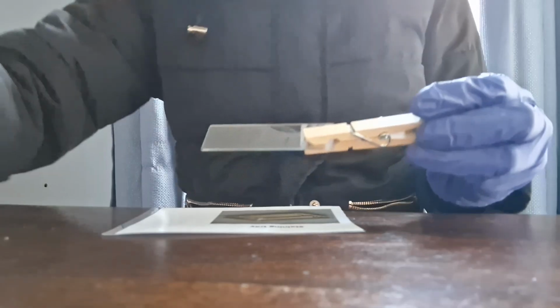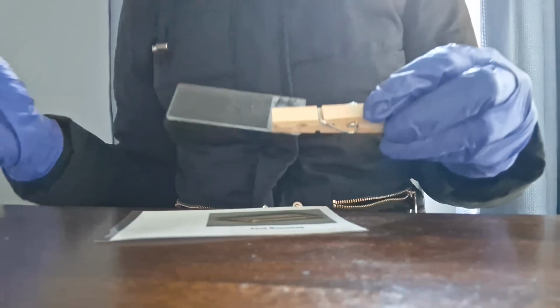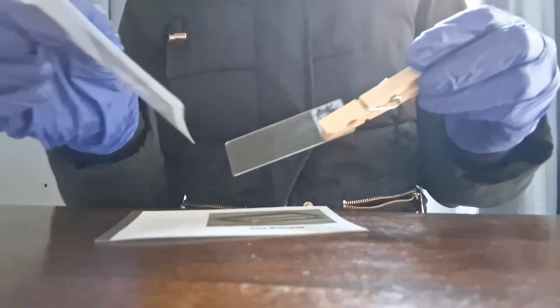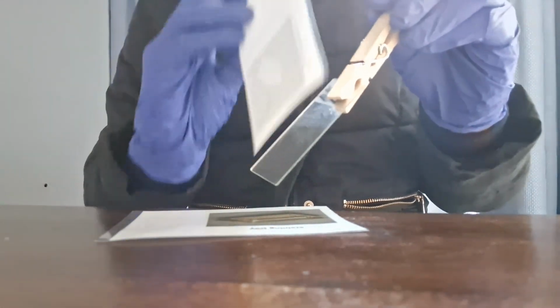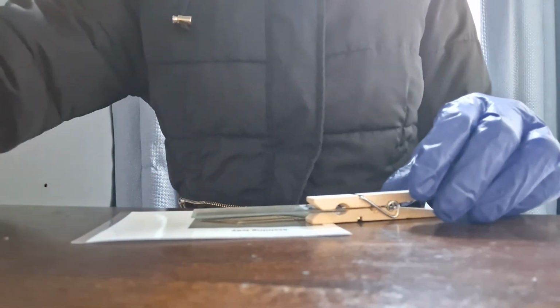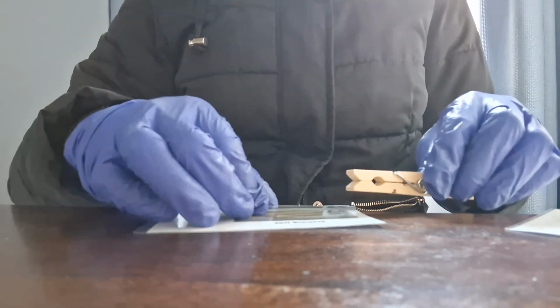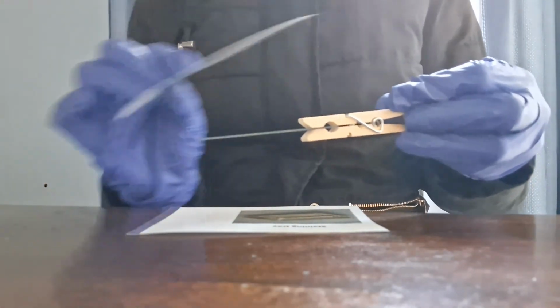The acid-fast cells will still remain the red color. Then we rinse it down with the water bottle after that. Finally, after we have put the slide back on the staining tray, I'll pick it up and use the methylene blue on it. Now the methylene blue is a counterstain.